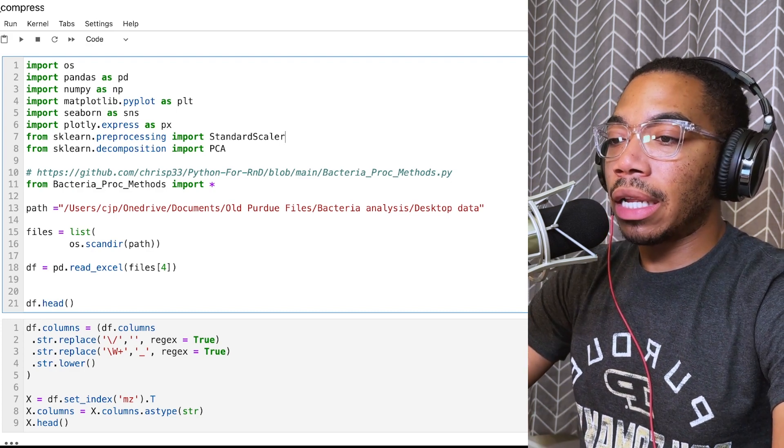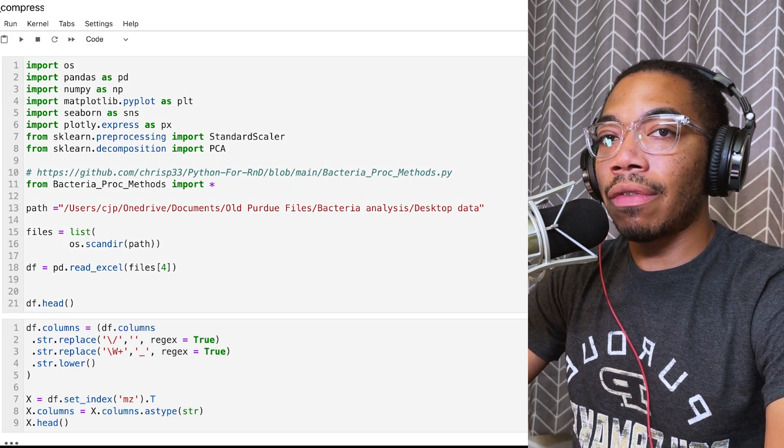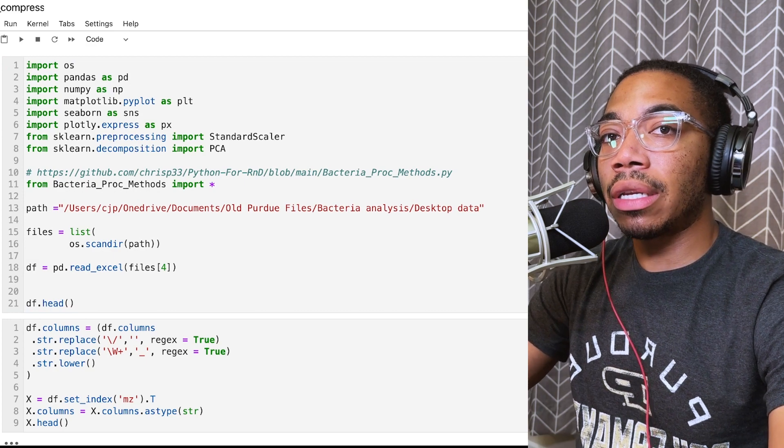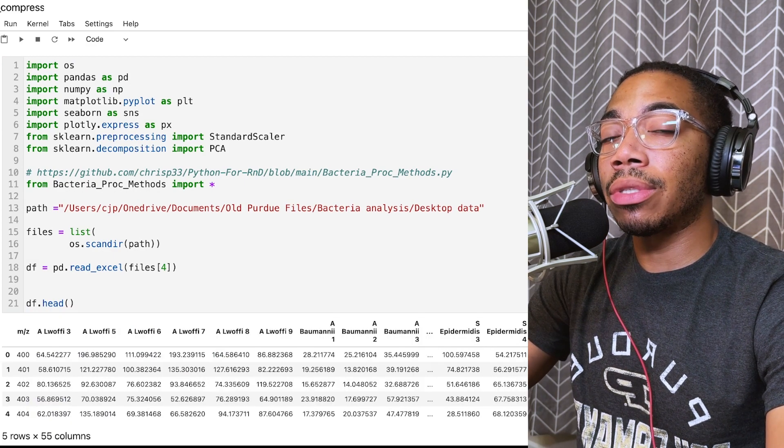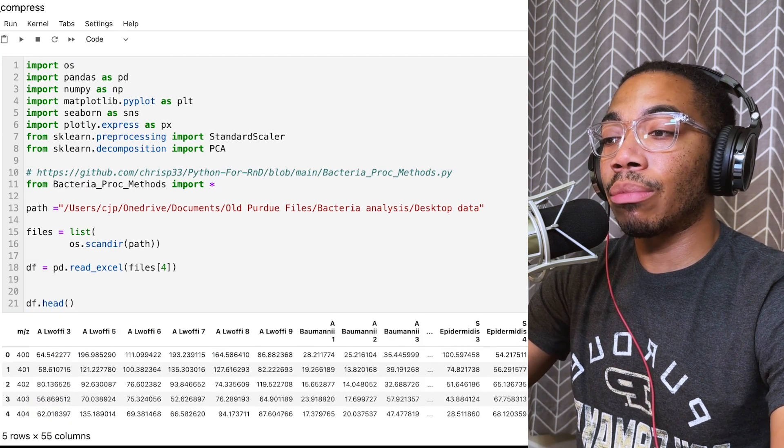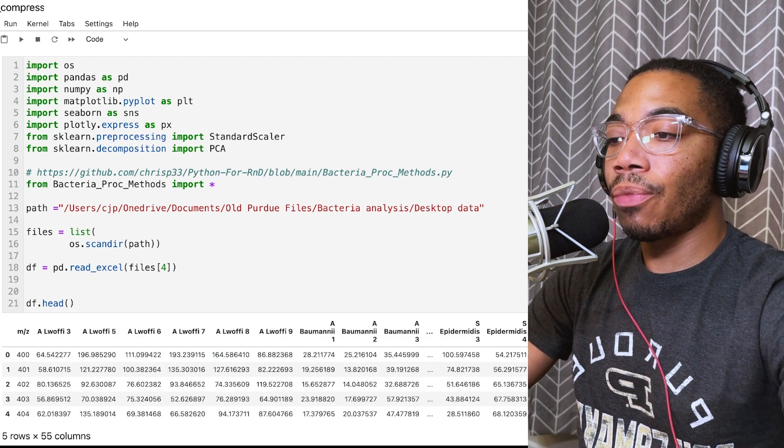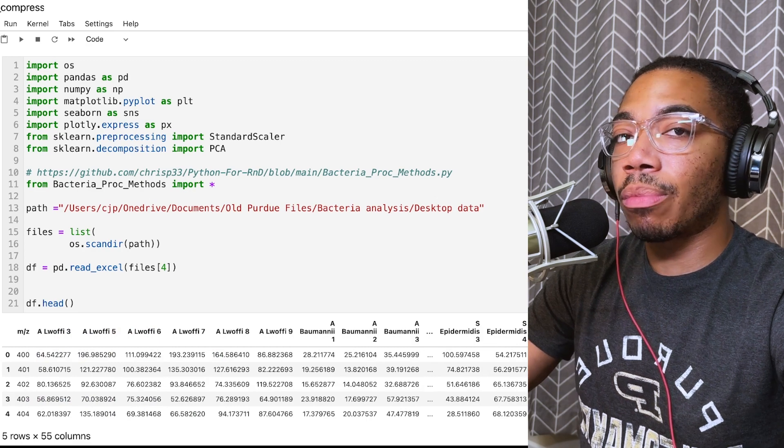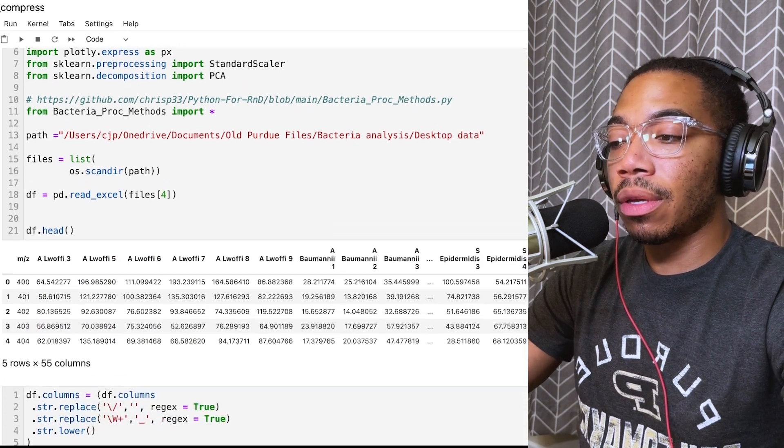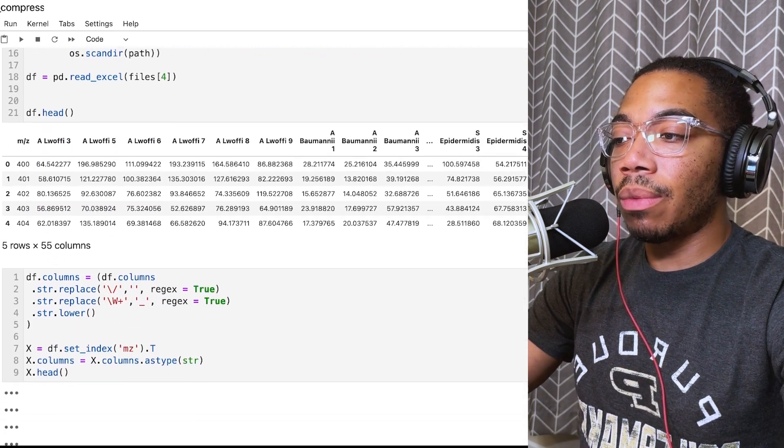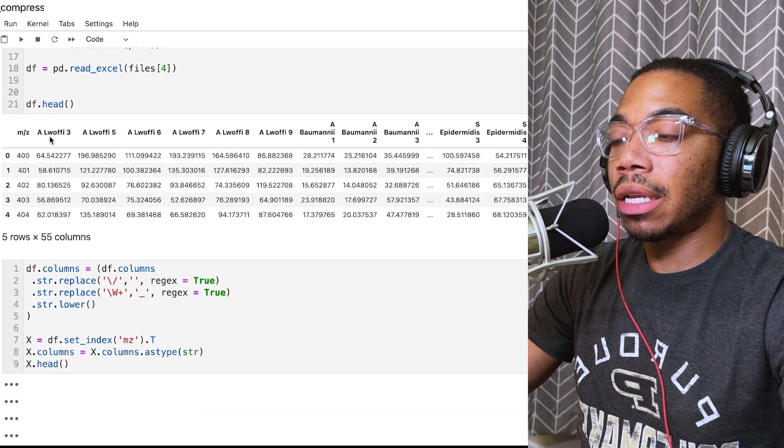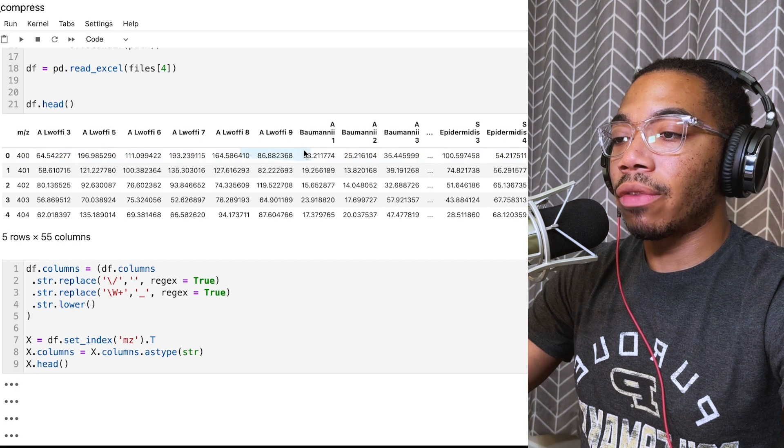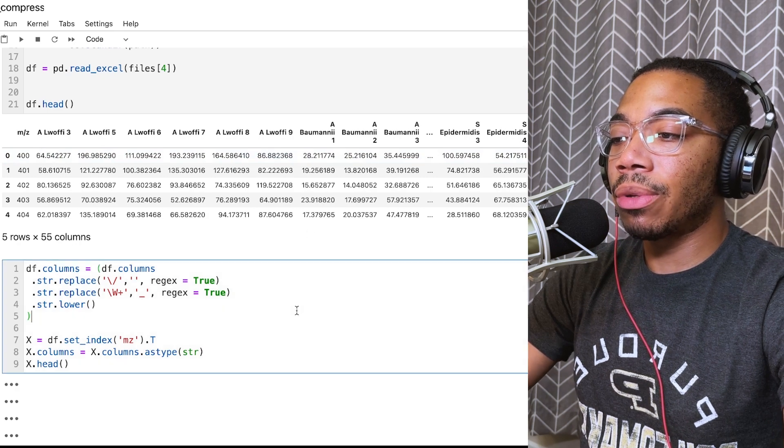So rather than writing a bunch of code, I've already pre-written it, and I can just work on examples demonstrating this compression effect with this data set we're pretty familiar with. We are looking at this mass spec data, where we have several bacteria samples.